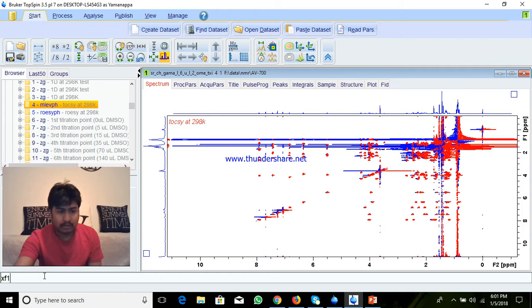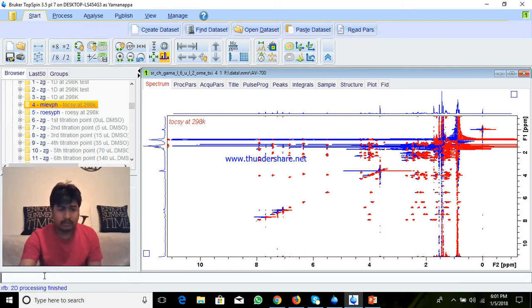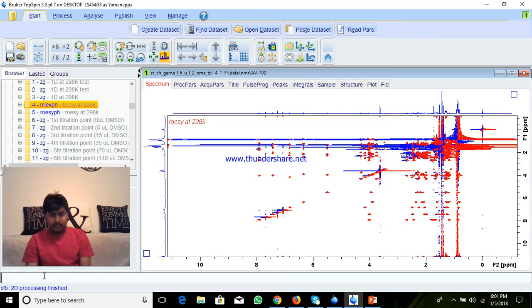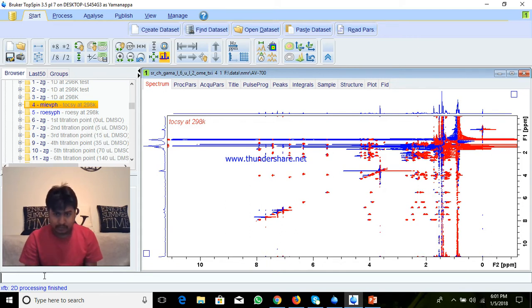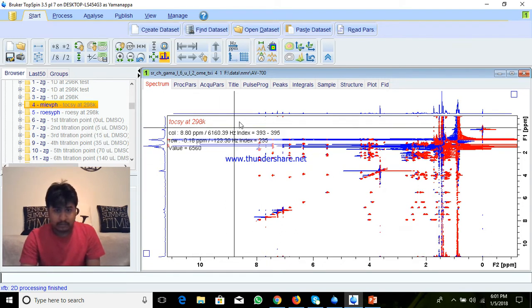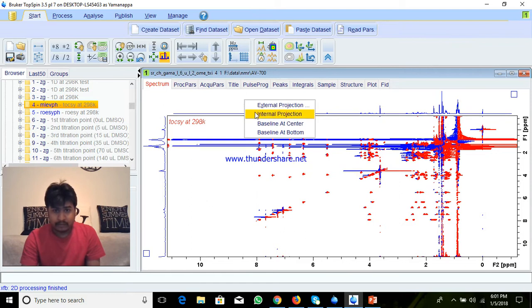Otherwise, you can use xf1 or ft1, or xf2 or ft2, and it will do Fourier transformation — meaning it converts time domain data to frequency domain.